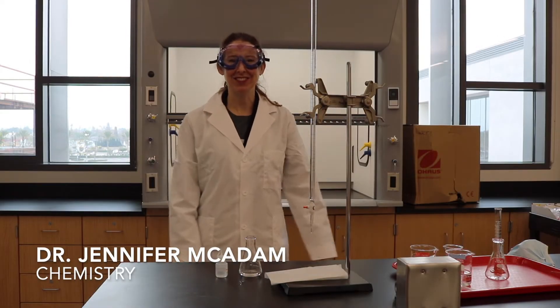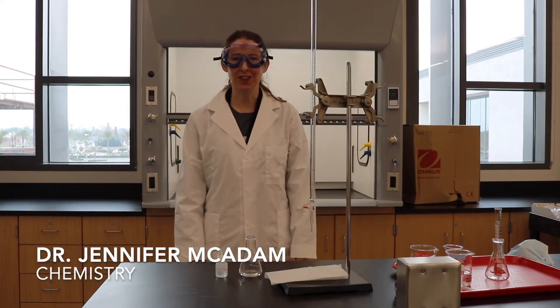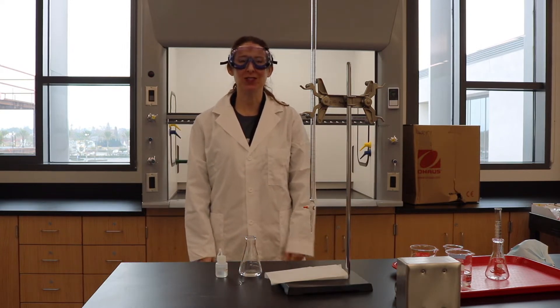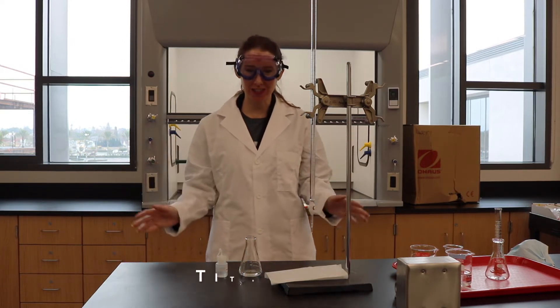Hello, I am Dr. Jennifer McAdam and I'm a professor of chemistry here at Santa Ana College, and today we are going to do a demonstration of a titration experiment.